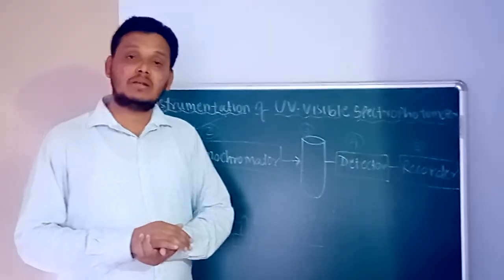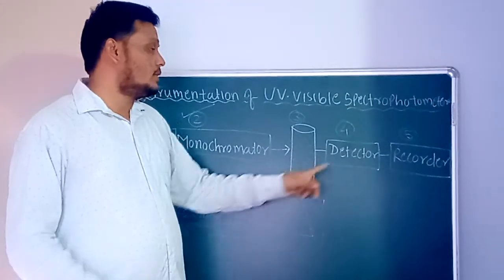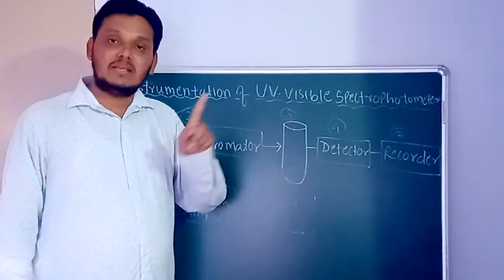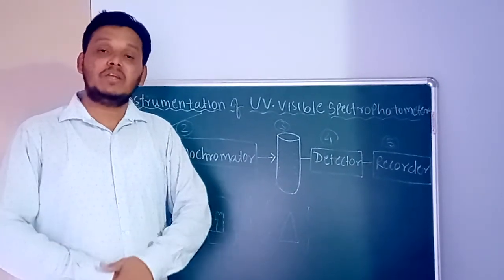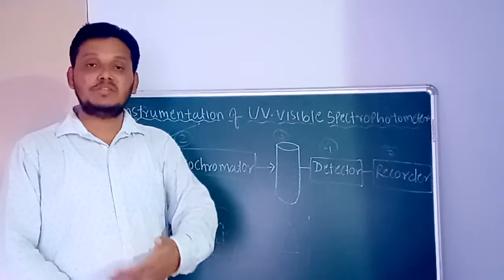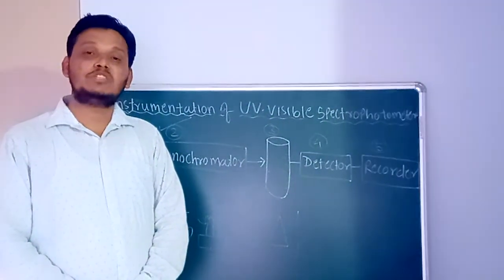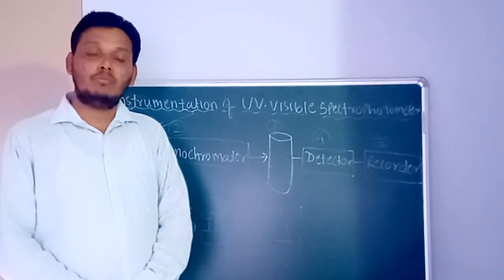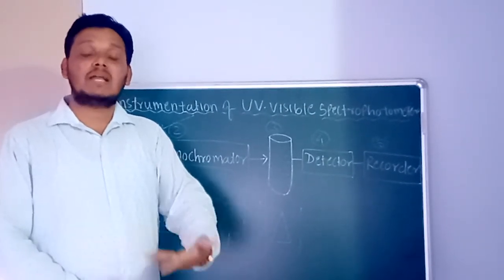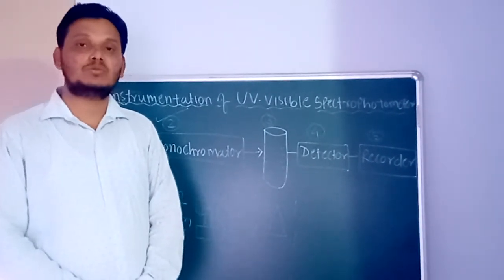These are used as detectors in UV visible spectroscopy.